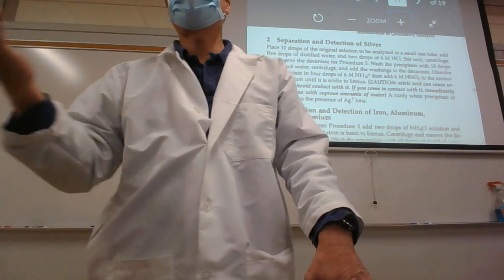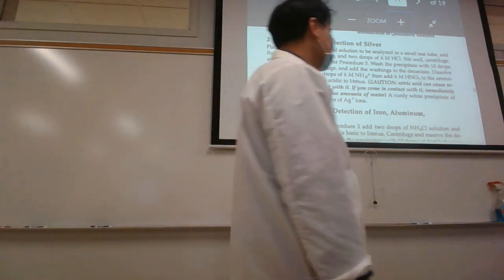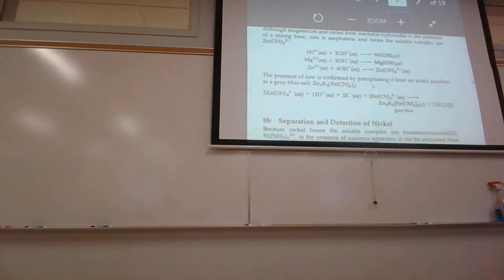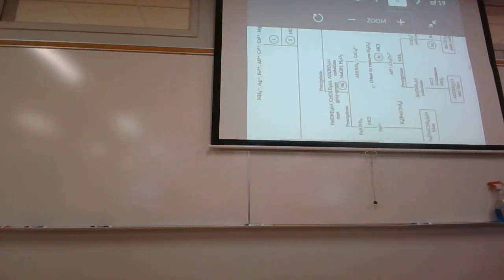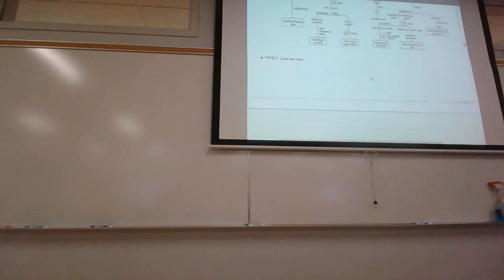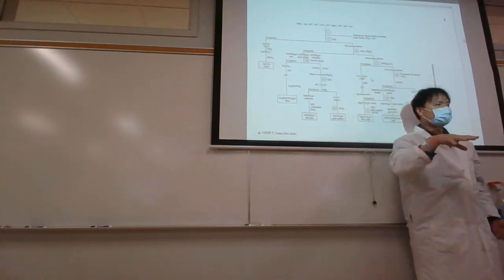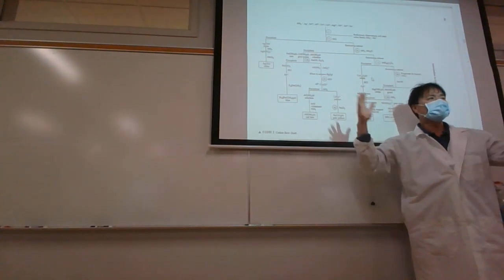The 2 things are, 1, more volume means it's going to be easier to detect, because by the end of this, the 10 drops you start off with at the beginning of the flow chart, and if you are not adjusting things as we're going along, that is, if you follow the procedure as written, you're going to have problems at the end.